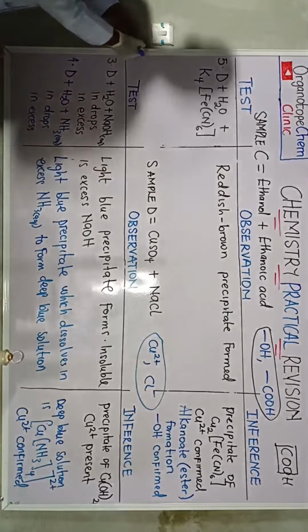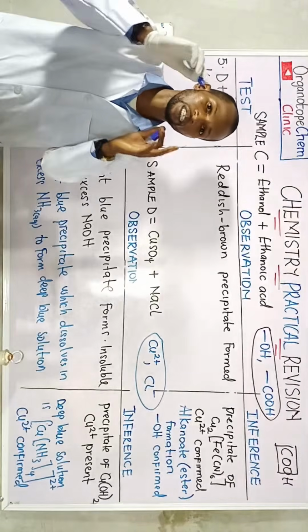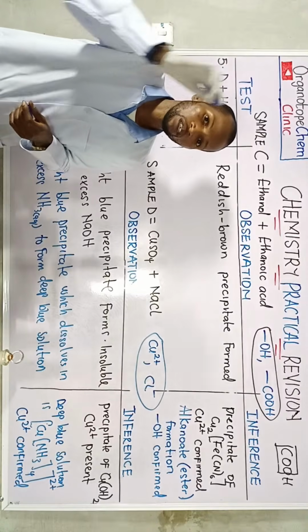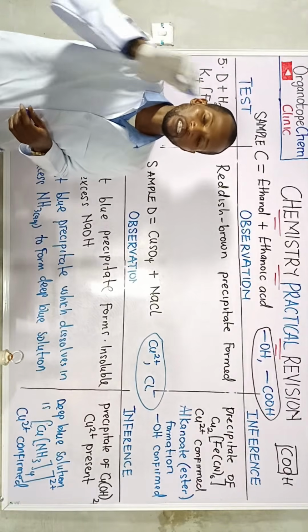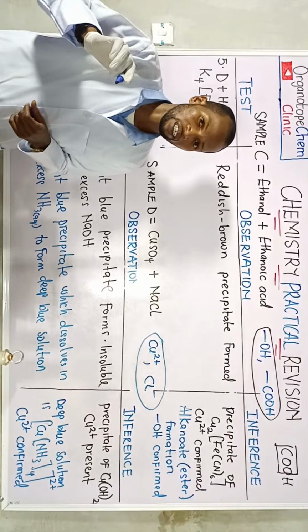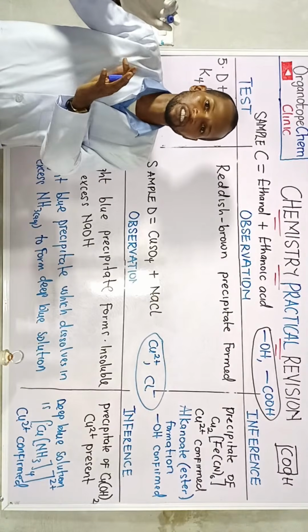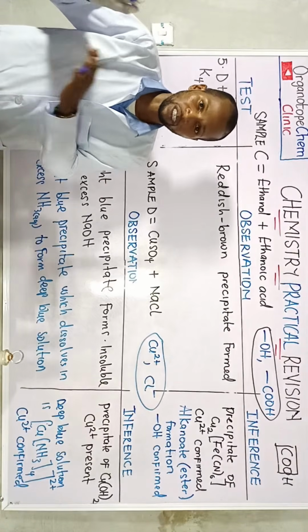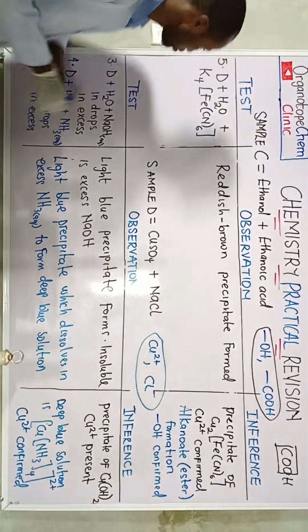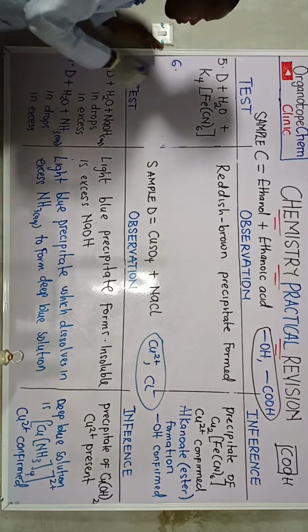Yes, let's have the test. I'm going to state the correct test using HNO3. So if you are provided with HNO3 in your exam, use HNO3. But if you are being served with hydrochloric acid following the procedure, or let me say the reagent that was stated for this exercise, make sure you write the HCl, but it is not ideal. So let us have the sixth one.